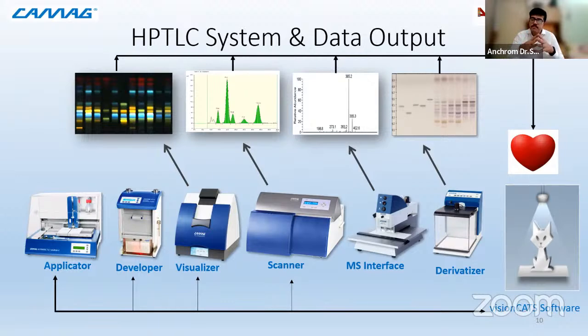I have to condition this plate by keeping it in a desiccator with saturated salt solution, exposing the plate for 45 minutes, which is done in this case in 10 to 20 minutes, and then the plate is ready. But when you do it manually, it takes 45 minutes. Then remove the plate, and then you develop with the mobile phase, and you have to monitor by yourself. And after you remove it, you have to dry it yourself and take it to the next module, which is the visualizer.